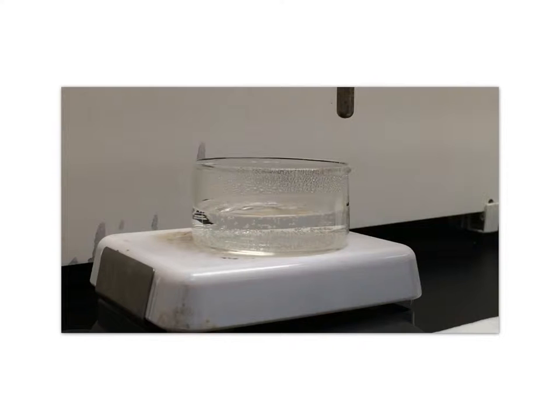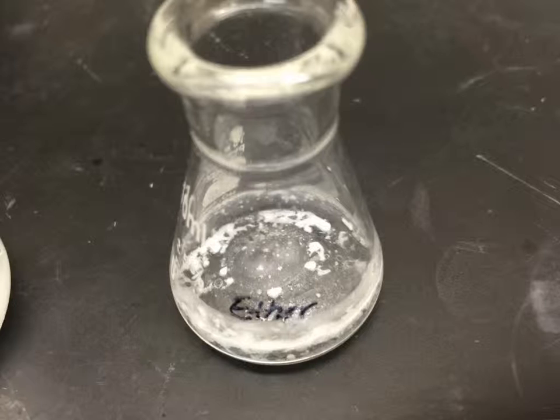The solution was filtered using a pipette, to which we added some cotton to prevent some of the sodium sulfate from going through into our final product, because this would alter the melting point results when we tested the neutral compound for its melting point. Once filtered, the solution was heated in a water bath in order to evaporate the ether and leave us with only the neutral compound to weigh and test. And this was what I got, which was a white precipitate.